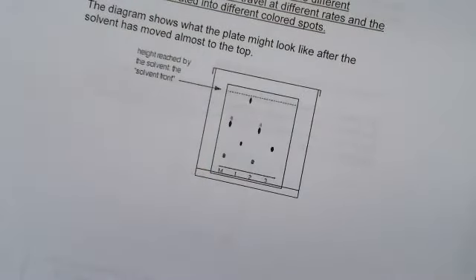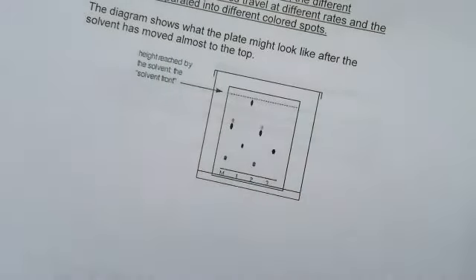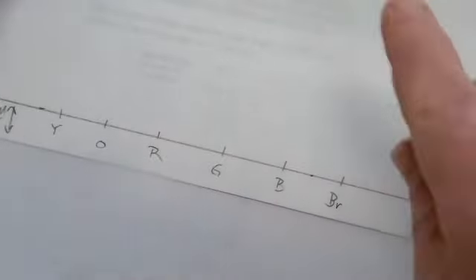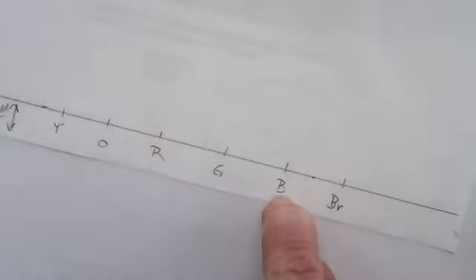We'll see. But your dye will end up being a kind of, I don't know, a bunch of blobs. And so the question is, as the mobile phase travels, is whatever M&M uses for the blue dye more attracted to the paper or attracted to the mobile phase, or kind of half and half?